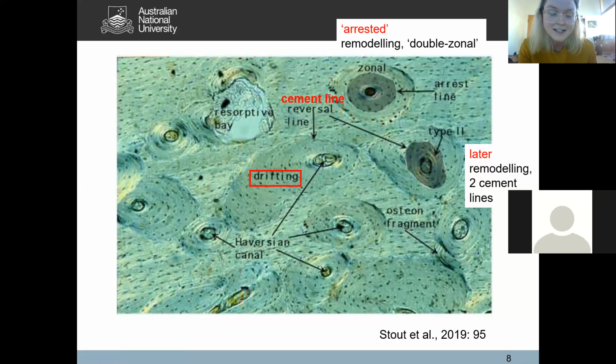I suspect it's just natural variation, because as we'll talk about a little bit later today, remember, the BMUs are 3D structures, right? They branch and cluster, they branch out naturally. So I think it's just possible for it to lose its course. So anyway, if you see something like this, like a long tail, it's what we call a drifting osteon.